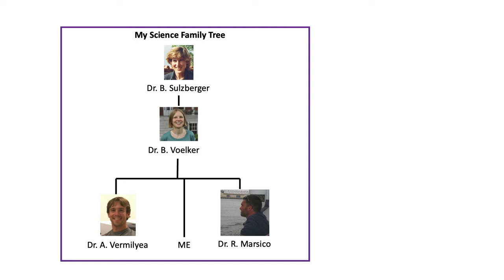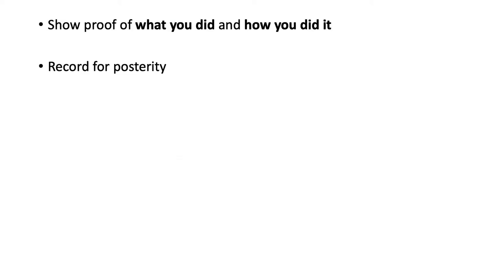We're trying to get you in good habits so that when you get into a research lab, which hopefully you will later in your academic career, you will keep a really good lab notebook for yourself and for the people who come after you. Okay, so again, you're showing proof of what you did and how you did it, and you're leaving a record for posterity. How can you do this?